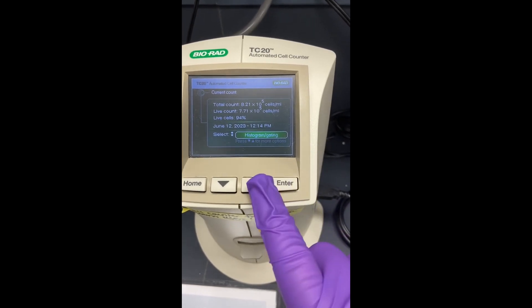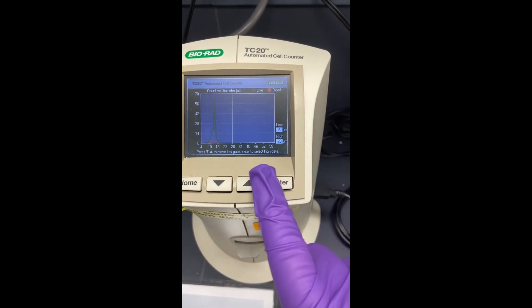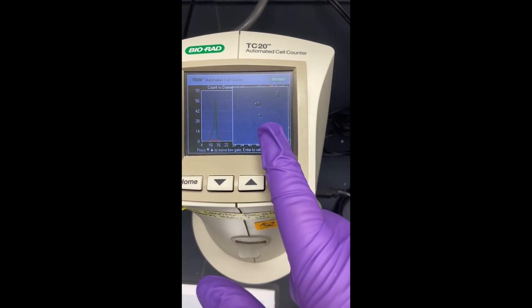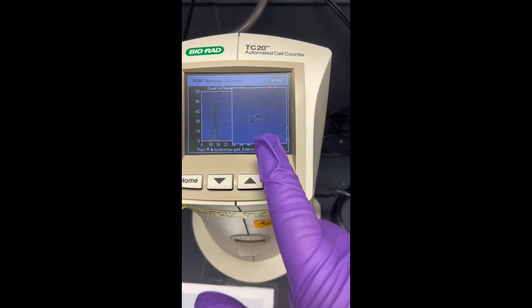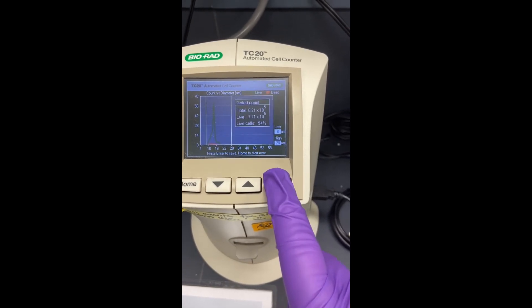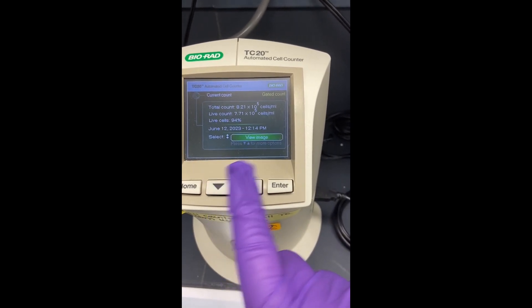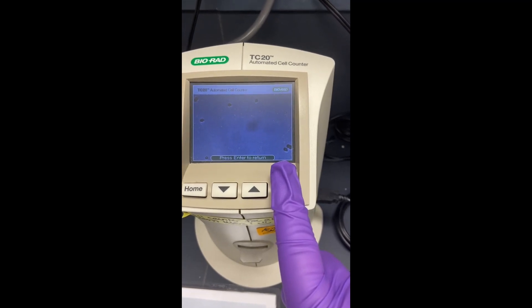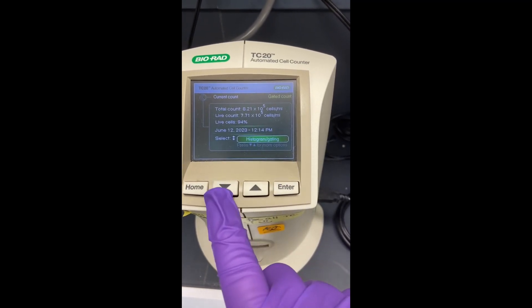So then you can go through your histogram gating and see how it counted. It'll actually show you examples. So if you have any questions about what it's actually doing, that's good. You can view various images around the slide.